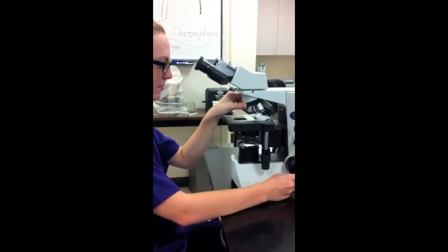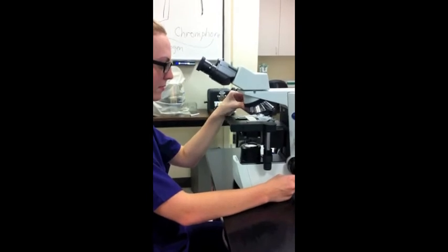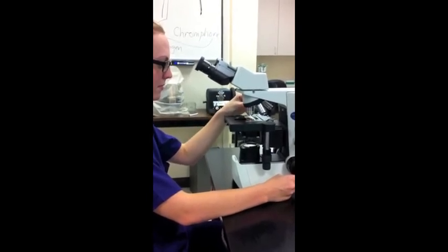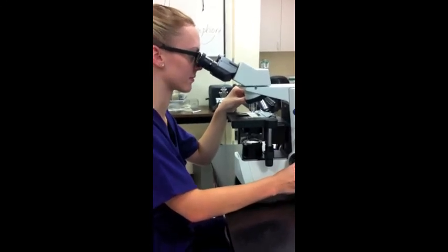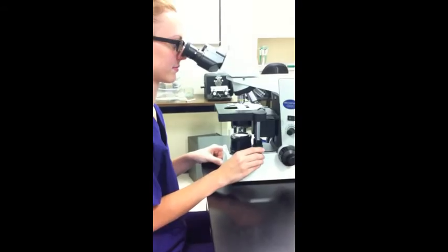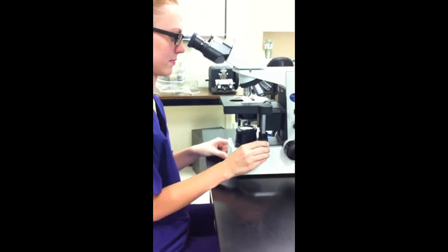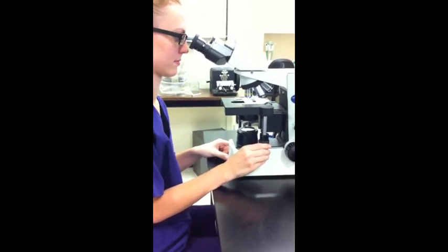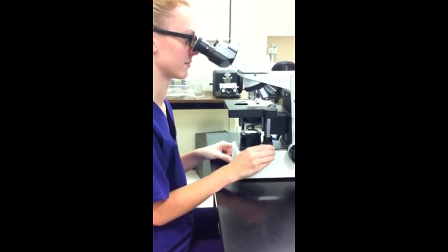Number nine, click the 10X objective into place and use the fine adjustment knobs to clearly focus your specimen. Number 10, use the stage adjustment knobs to move your specimen to the middle of the field of view. You must do this before moving to higher magnification because your field of view becomes much smaller. This slide is 10X.